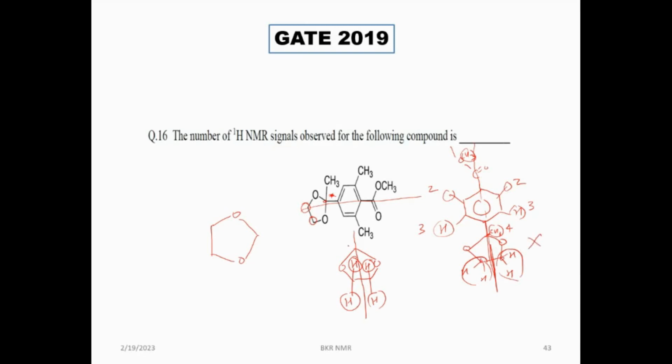This is the way you should look. So when I cut the molecule, these two hydrogens are identical. So these two are identical like this. Okay. So the top hydrogens, they are not identical to the bottom ones, because they follow a different symmetry. You cannot cut the molecule in the center. So the top two hydrogens are identical, the bottom two hydrogens are identical. Till this I had 4. So top hydrogen 5, bottom hydrogen 6. So this is the way you should look at the molecule.